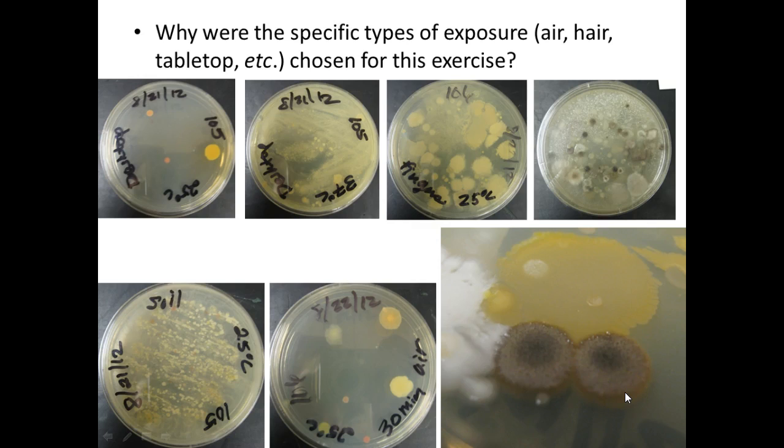And partly because we have a HEPA filter running in this lab to help with contamination from this type of organism. Anyone know what type of organism has that fuzzy appearance when it grows on the agar plates? Fungus, mold, right? Yeah, mold spores. So mold spores would land on it and then grow, and they produce these aerial hyphae. We'll look at them under the microscope next time, and they release spores.